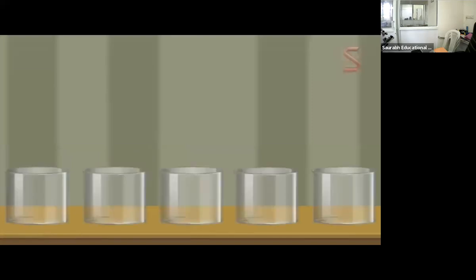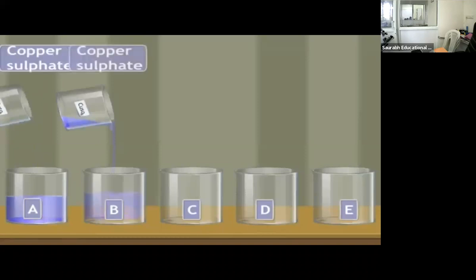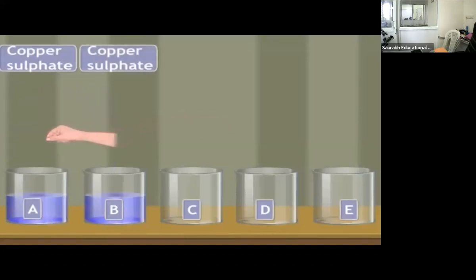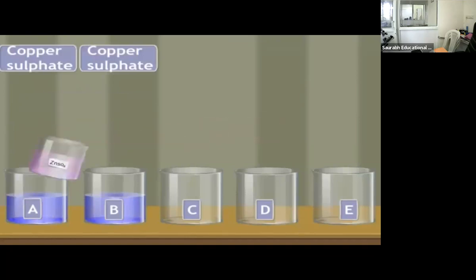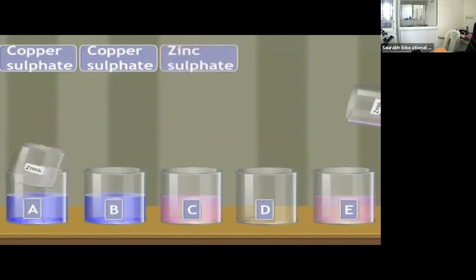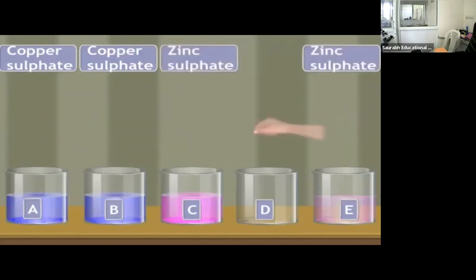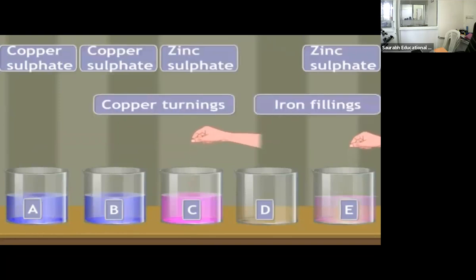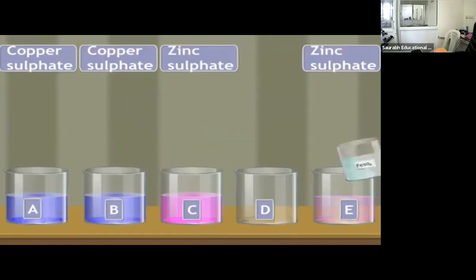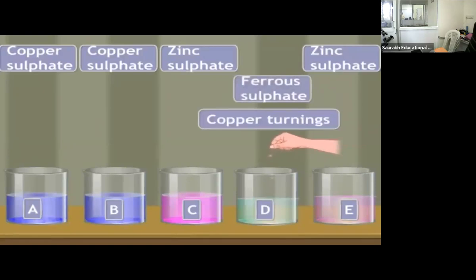Let's take five beakers A, B, C, D, and E. Let's take copper sulfate in beakers A and B, drop some zinc granules in beaker A and iron filings in beaker B. Take zinc sulfate in beakers C and E, drop copper turnings in beaker C and iron filings in beaker E. In beaker D, take some ferrous sulfate solution with a few copper turnings.